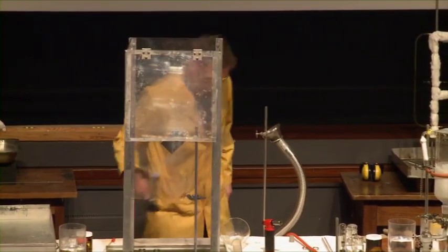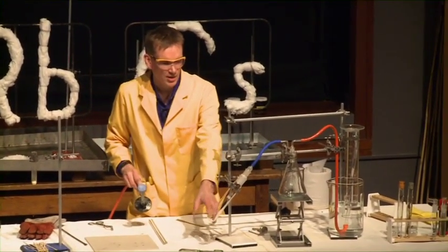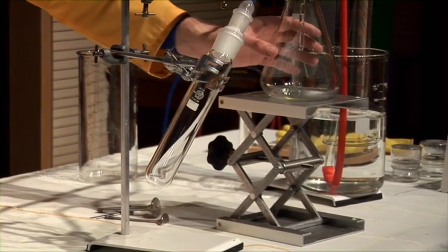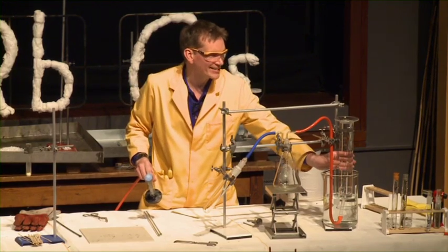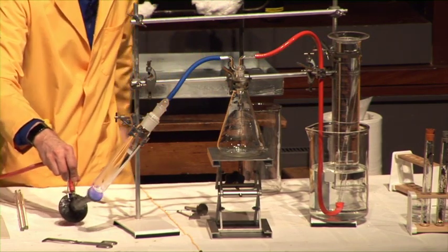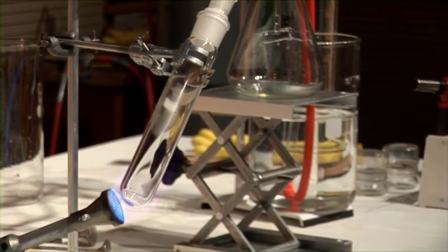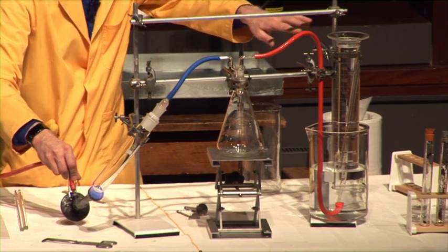Sodium azide — watch what happens when we heat up some sodium azide. So in the tube here, we have a small quantity of sodium azide. This is a white solid in the bottom of the tube. I'm going to heat this up. This is just to make sure no gases come backwards and no water comes into the apparatus, but we will be collecting any gases formed by displacing the water in this tube. Just warming it, and you can see maybe just because the air is expanding, a few bubbles have come up.